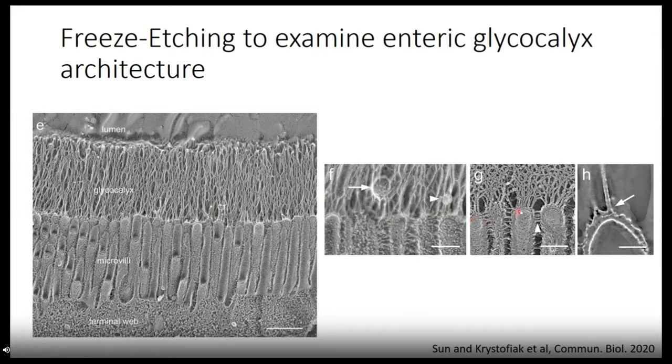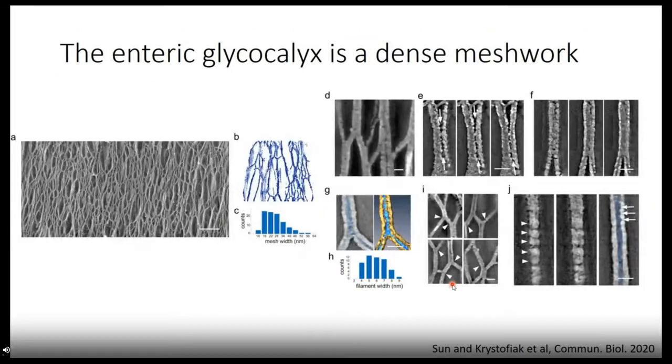We can see that where the mucins leave the microvilli is a different location than where the cadherin, protocadherin links are that bind the microvilli together. So the mucins are more apical, really just from the tip where they kind of fan out and interact with each other.